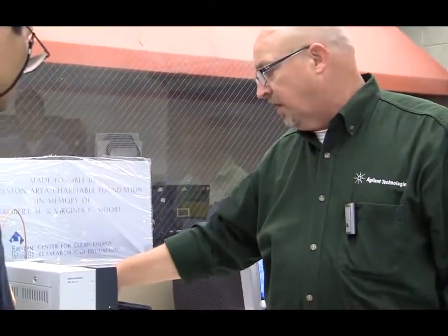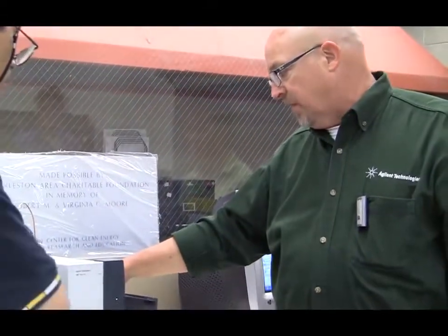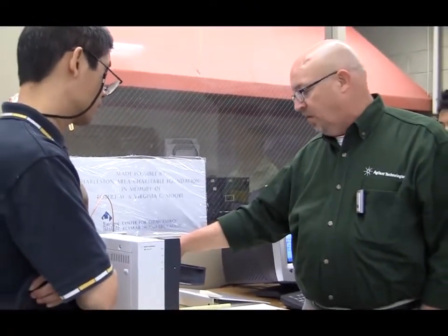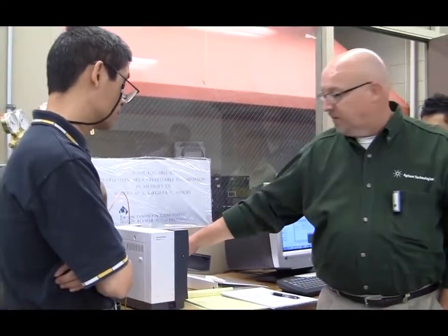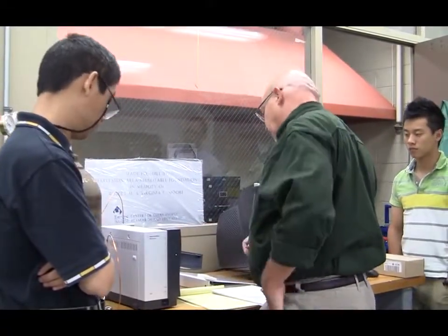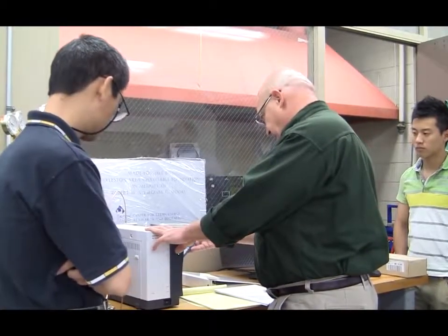So if you see that you're not getting sample in, you might want to check that frit and see if there's anything on it. The other is an exact match for that frit, the 5-micron frit, inside this fitting. Don't ever get anything in there, because you'd have to replace this fitting. That's why we have the external filter on. So that's it in a nutshell.